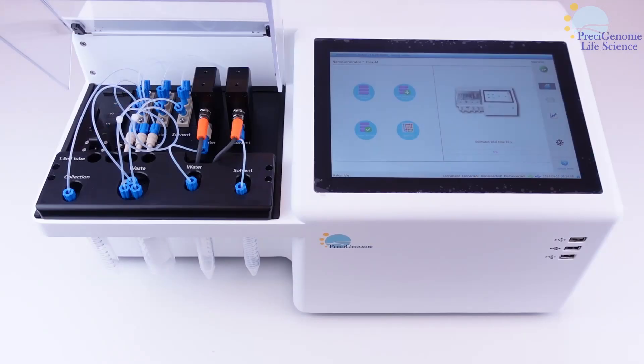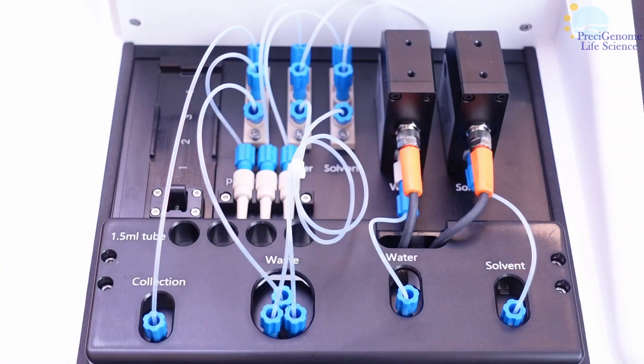The FlexM has two major components: a flow unit and a pressure controller. We will first go over the flow unit, as it will hold the mixing chip and fluid reservoirs.